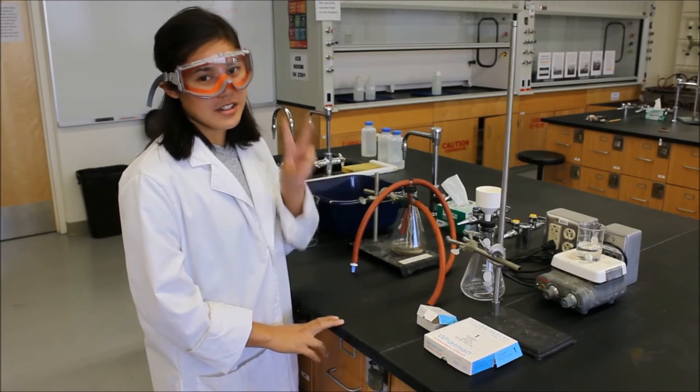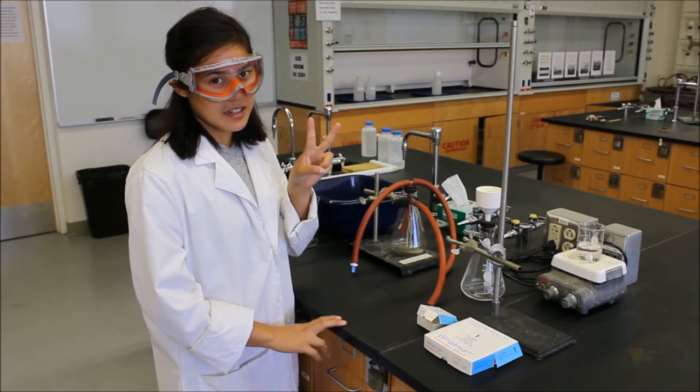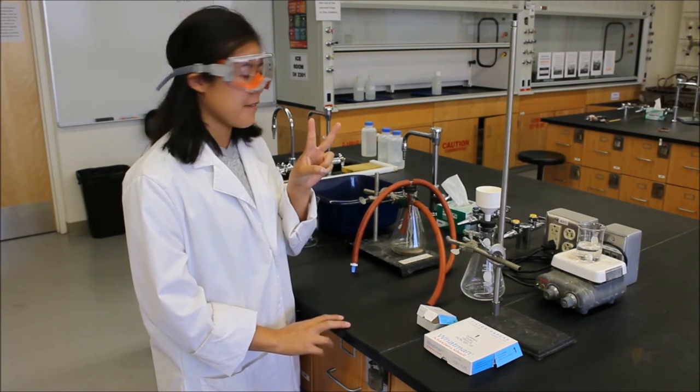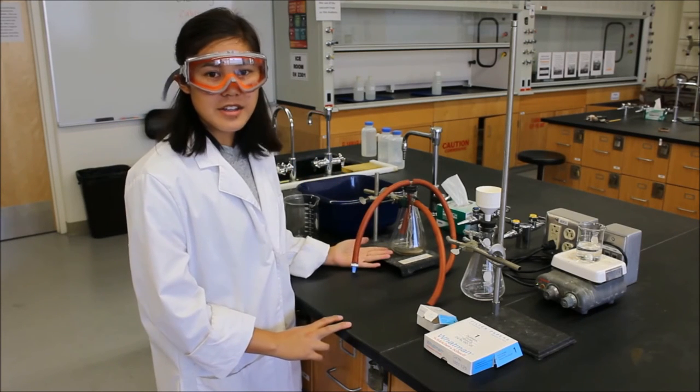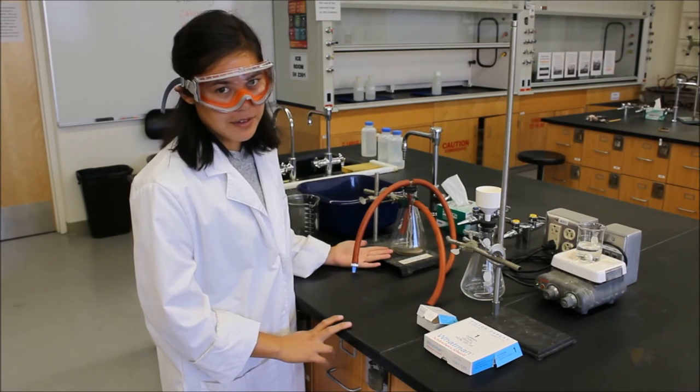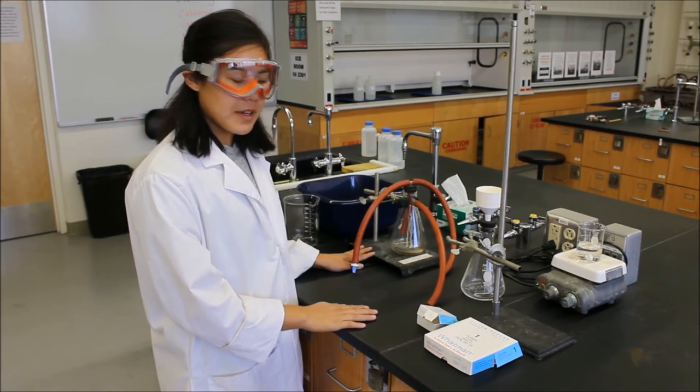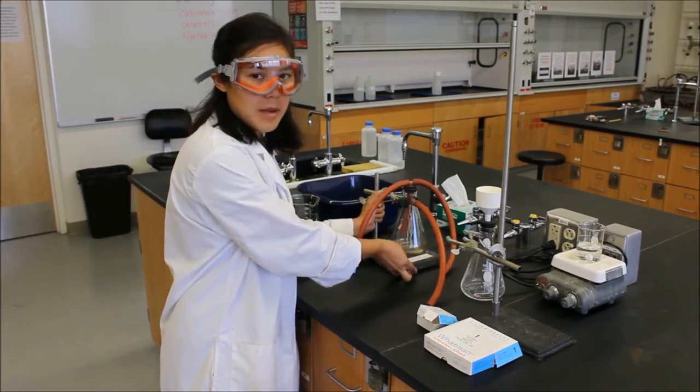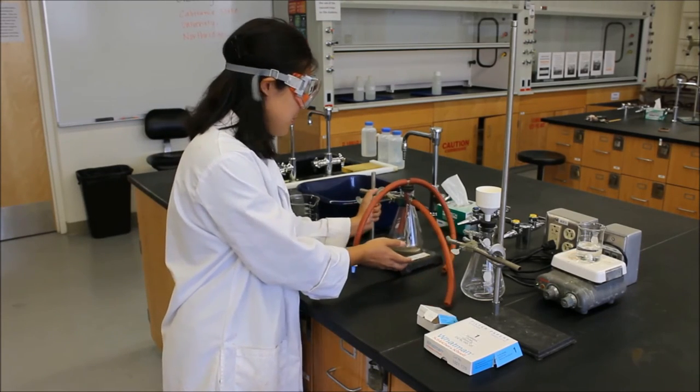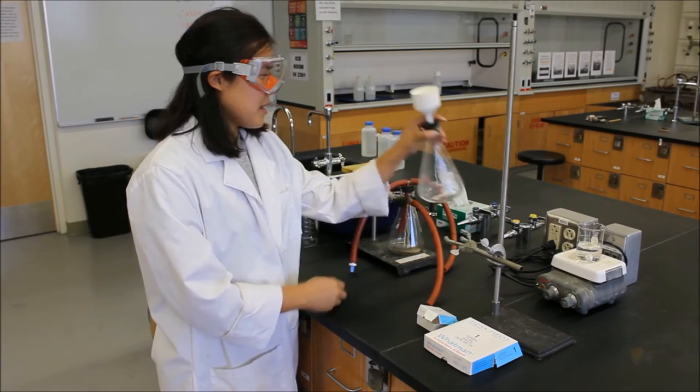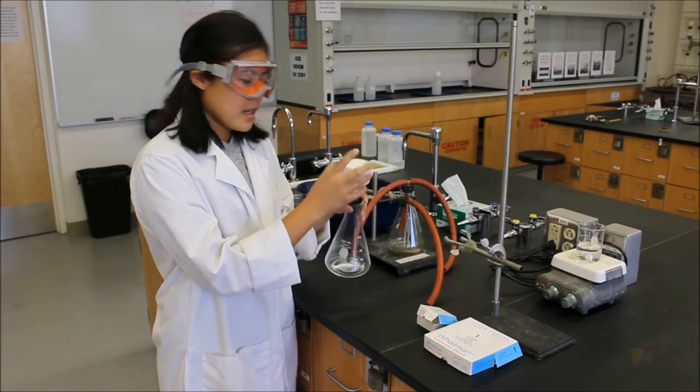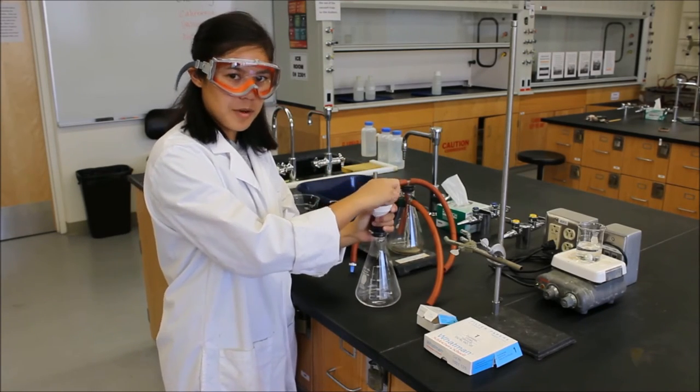So because this is a two-day experiment, we're going to need to be able to set up a filter vacuum trap so that we can filter out our crystals after we've let them sit and let them grow. So what we do is we need a vacuum trap here and we need a Buchner funnel. Now inside the Buchner funnel, this top part is removable.